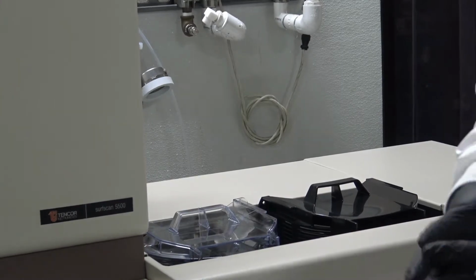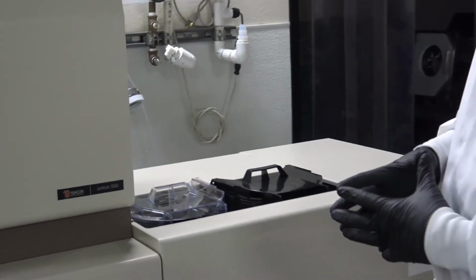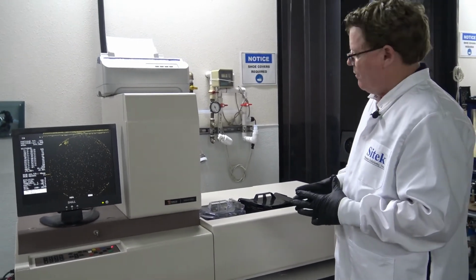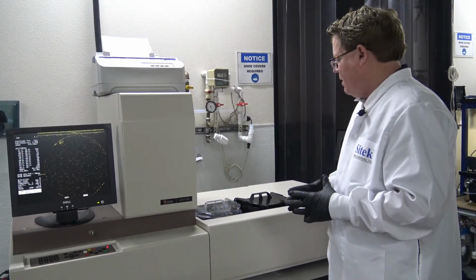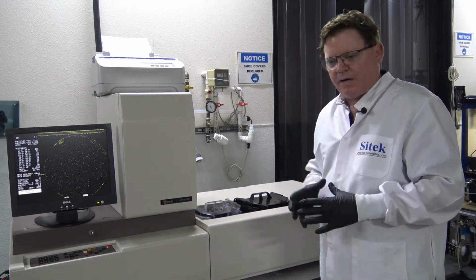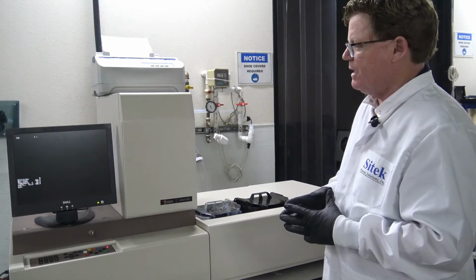We've been cycling the machine for the last 2 days. It's probably cycled 200 times in various conditions. So we feel very comfortable that the customer can use it. This customer is in desperate need for a particle counter. Their current particle counter is 6 inch, and they have some 8 inch processing they need.